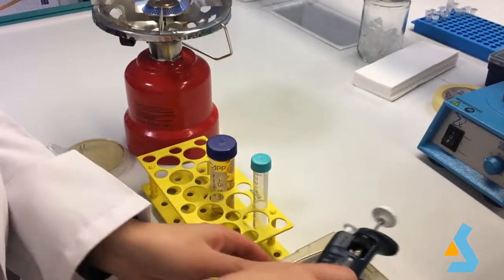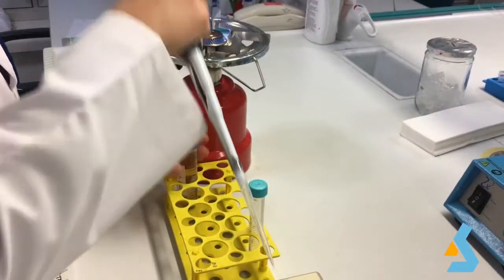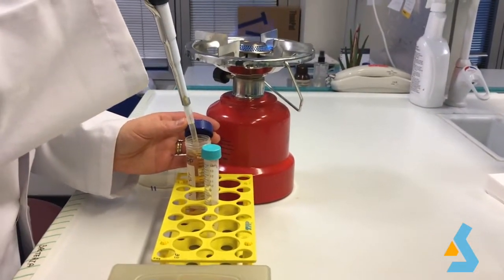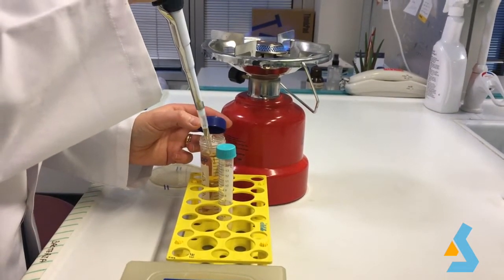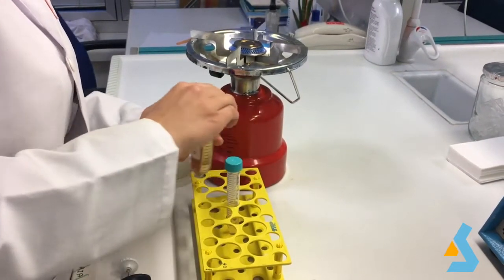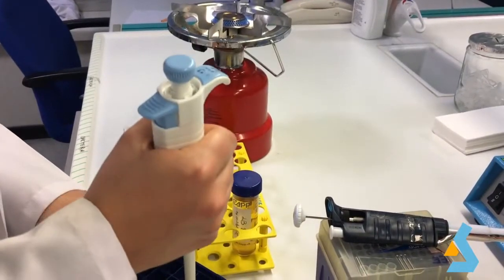We put 3 ml of LB medium to the tube via a sterile pipette and tips, or here we can also use serological pipettes. After taking 3 ml LB, the lid of the Falcon tube and LB stock was closed tightly. Then we added 3 microliter antibiotic, which is kanamycin, and mixed well.